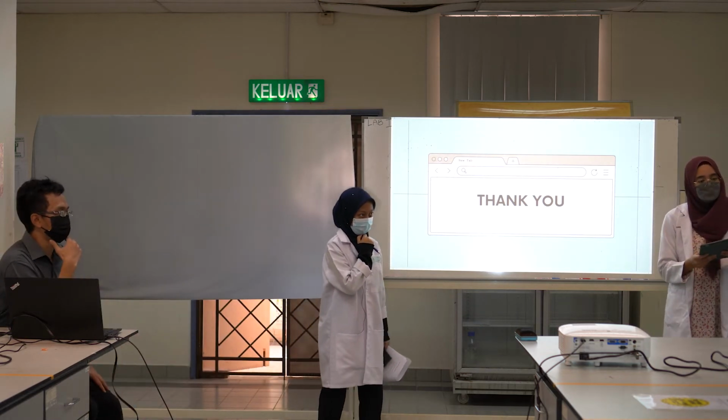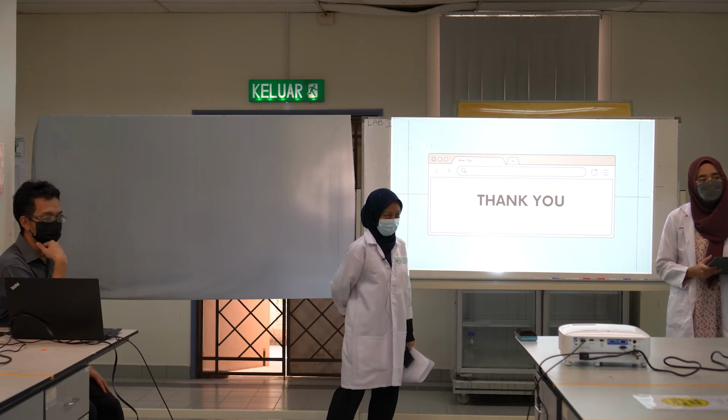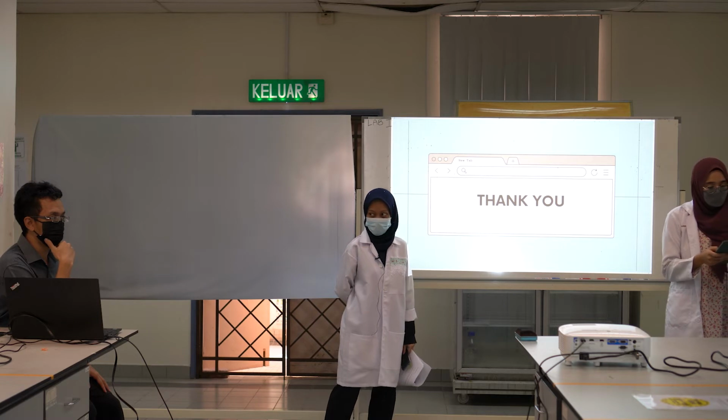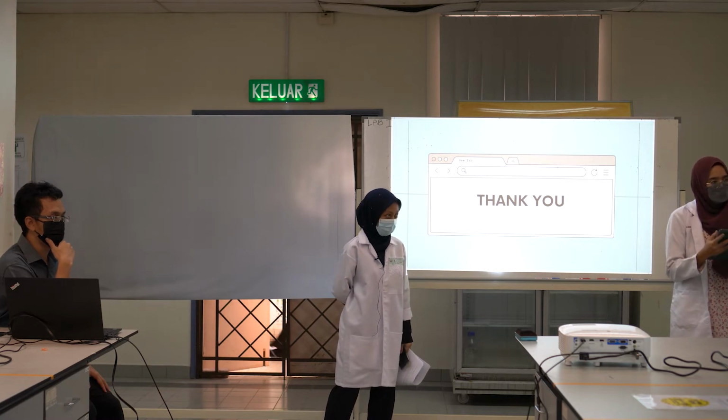My question is, when we use the distillation setup, we have two products: the one that flows into the flask, and the one that is left as residue in the round bottom flask.